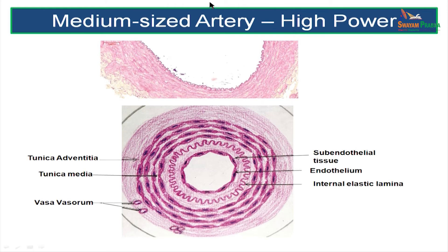In a higher power view of a medium sized artery, you can see a very prominent internal elastic lamina. The fine tissue inner to this is the endothelium along with the subendothelial tissue. The thick layer is the tunica media and the outer is the tunica adventitia. The internal elastic lamina appears wavy because during rigor mortis there is contraction of smooth muscle, which makes the elastic fibres become wavy as the diameter of the vessel reduces.